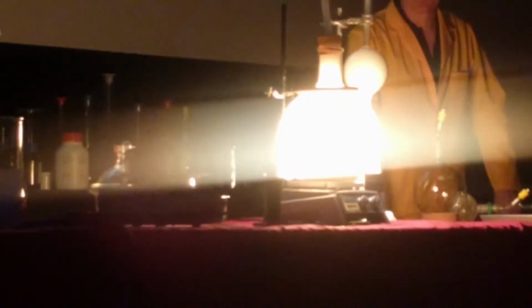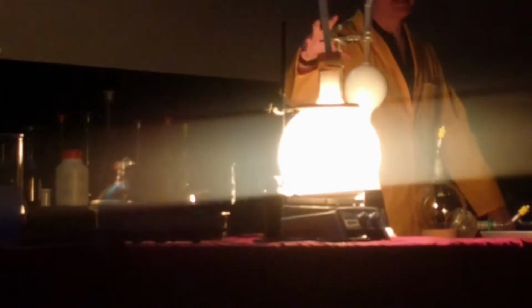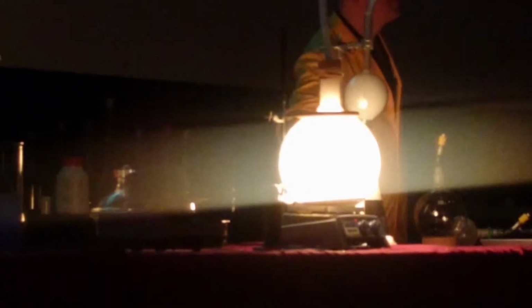This is the element phosphorus, and phosphorus actually gets its name from the light bringer. So this is carrying the light here. It gives out a lot of light during this violent reaction. It's the phosphorus combining with the oxygen from the air, and it's forming phosphorus oxide.